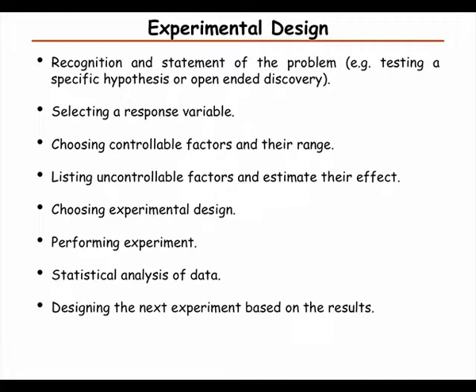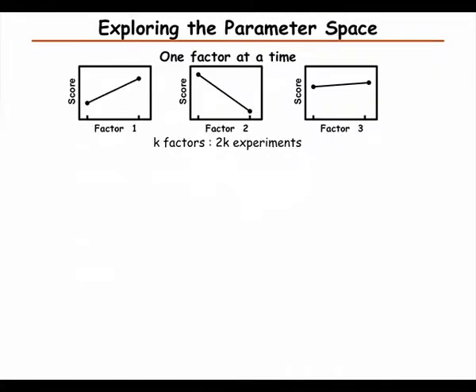Then we choose an experimental design, perform the experiment, and then comes the data analysis. And then, of course, this is usually an iterative process, where we go on and design the next experiment based on our results from the first one.